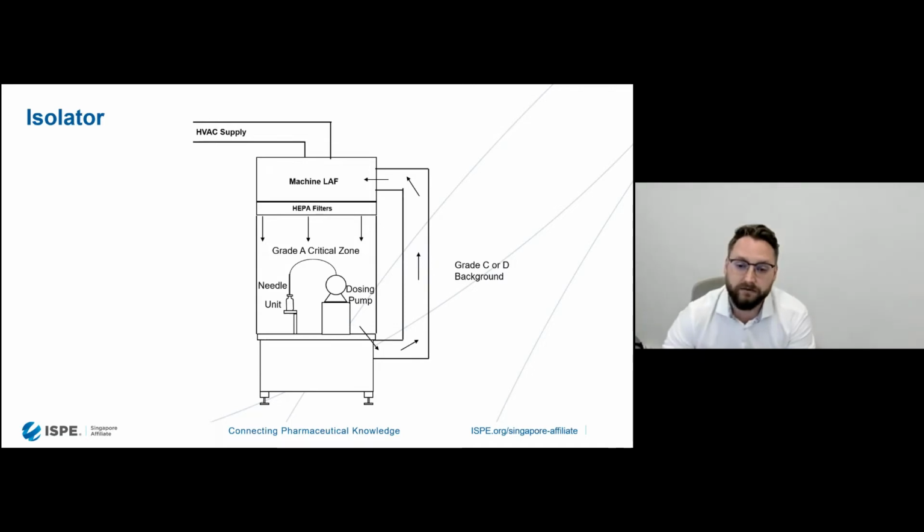But depending on the product, it may need to be separated from personnel for safety reasons, or for whatever it is. When it comes to the decontamination cycle, these would be a bit faster in the aeration phase, as you could just exhaust the H2O2 rich environment completely out of the system and not have to wait for it to break down over a catalyst.